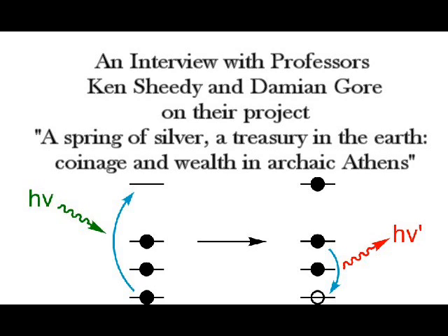I think at the very start you need to have very closely defined questions, and you also have to have a really good understanding of just what your evidence, your particular coins, are going to be able to tell you. So in designing a project and thinking, what can we do with XRF, it's not a matter of simply saying, gee, there's this wonderful new scientific capability, what will happen if I dump all my coins into the machine? Will there be an incredible readout that will give me this unparalleled insight? It doesn't work like this. You still have to do the basics with your evidence. You have to really understand the nature of the questions that can or cannot be answered.